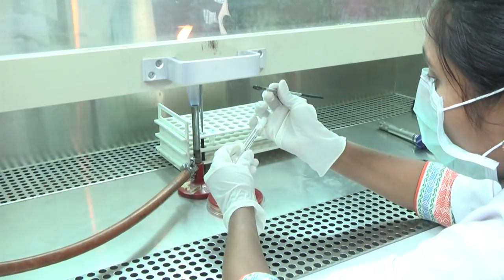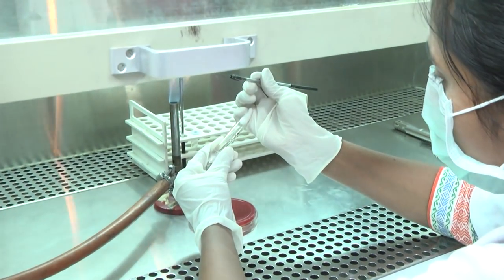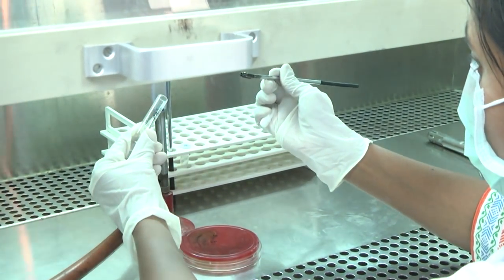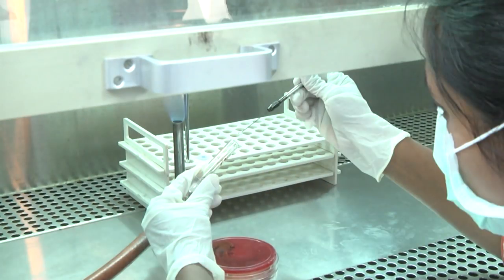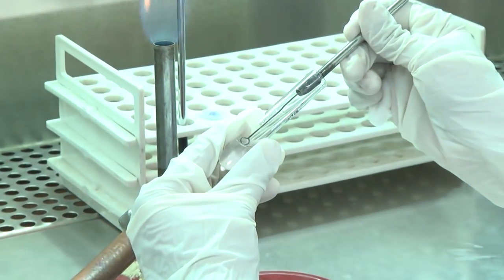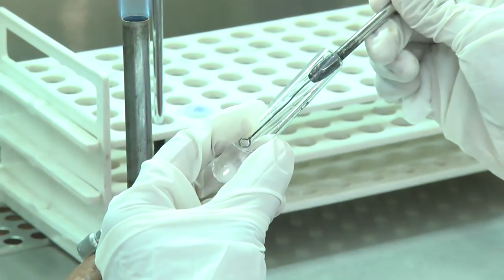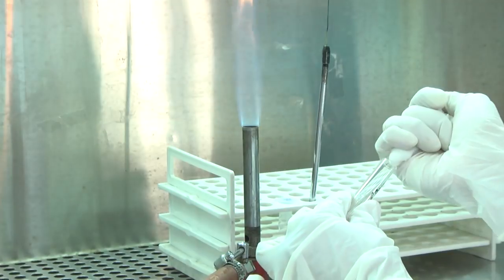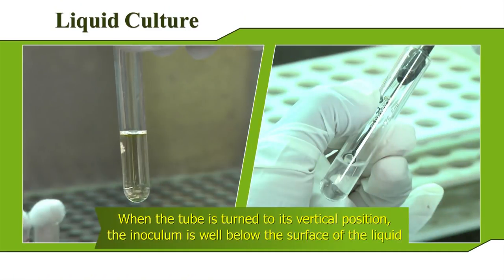Hold the liquid medium in your left hand and remove the cotton plug or cap with the little finger of your hand and flame the neck. Incline the tube or bottle at an angle of 45 degrees and deposit the inoculum on its wall above the surface of the liquid at its lower end. Flame the neck of the tube or bottle and replace the plug or cap. When the tube is turned to its vertical position, the inoculum is well below the surface of the liquid.